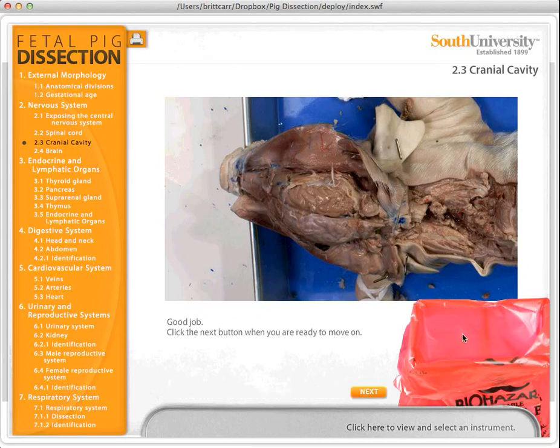Okay, so after each process is complete, the students identify or tag each exposed part that has to do with the system being discussed.